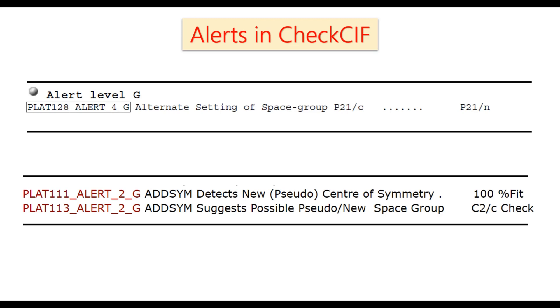So sometimes we are getting this type of alert in CheckCIF. So how to get rid of this alert? So how to fix this alert? Let's see.